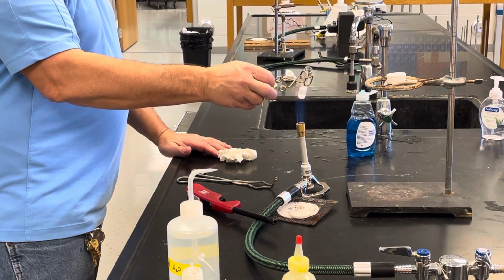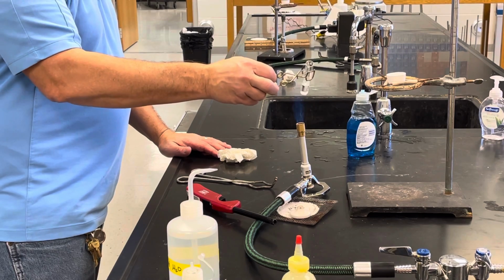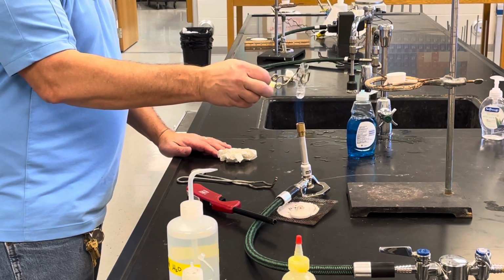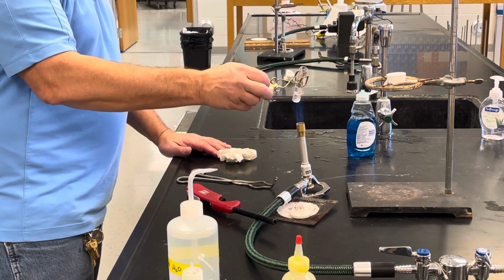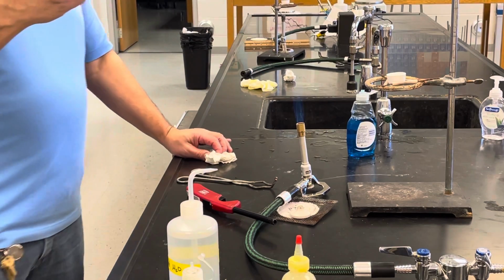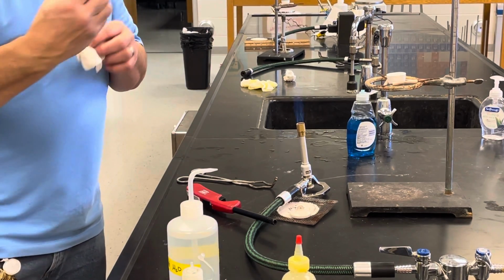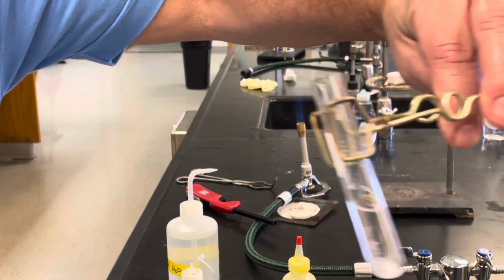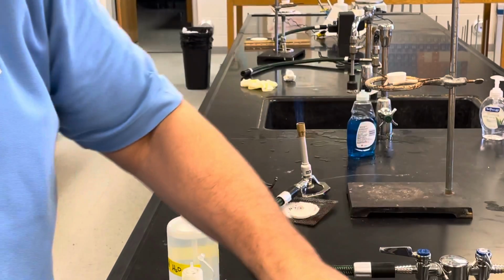So as I just heat this up just a little bit, kind of stirring it as I'm heating it just by shaking it a little bit. You can see that all of your solid redissolved, okay?